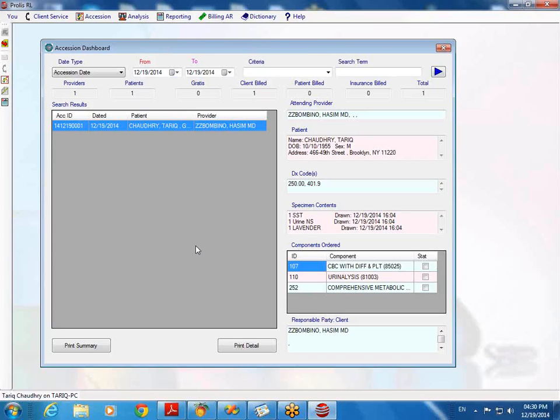If you have a laboratory like in California, initially we issue the license on a per site basis. Our license is for one single site. On the single site, we provide you a specific number of seats, like 36, 48, 200, 500, as many as you want.